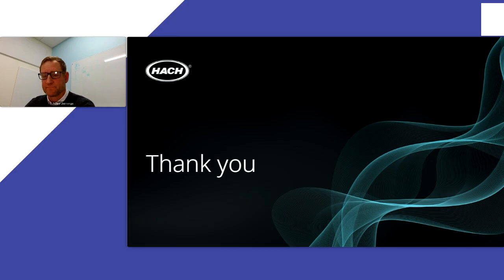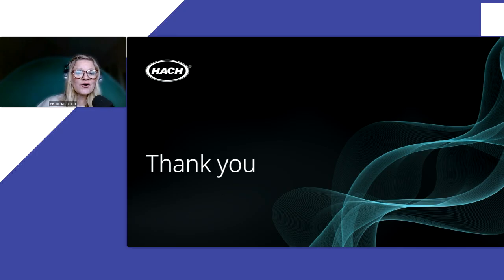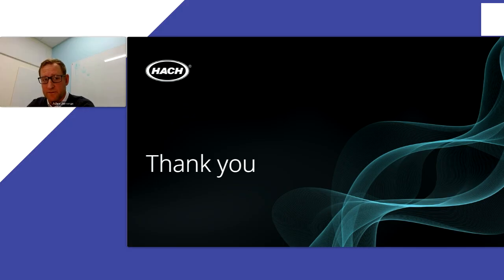Very good. Thank you, Adam. The next audience member would like to know how often the online sensor takes samples. Great question. It's an adjustable time frame. The fastest values you can get back are every 5 minutes, and that's usually plenty fast enough to do things like ammonia-based aeration. But if you don't need values quite that fast, you can change the sample time frame to a higher value, 10 minutes or more. But 5 minutes is the fastest you can get a value.